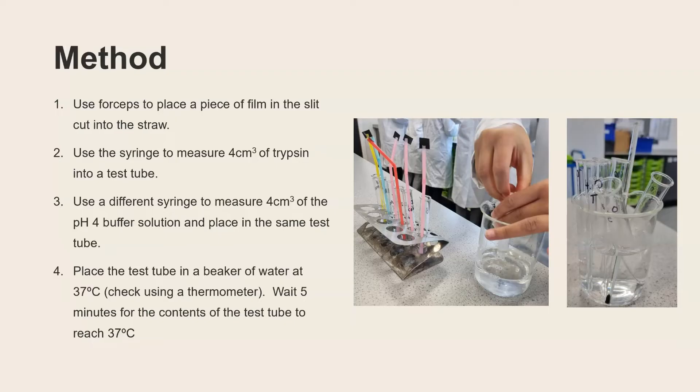We leave that for five minutes and the reason it's five minutes is to allow enough time for the liquid within the test tube to reach the temperature of the water bath which is 37 degrees C. So the buffer that we've used here that is to make sure that the enzyme is at a particular pH and in this case it's pH 4. But we will repeat this process for all of the different pHs that we'll be testing at. Now for this one we aren't actually using an electronic water bath it is a manual one so the students would have used water from the hot tap or maybe a kettle and adjusted it using a thermometer to check until they got to 37 degrees C.